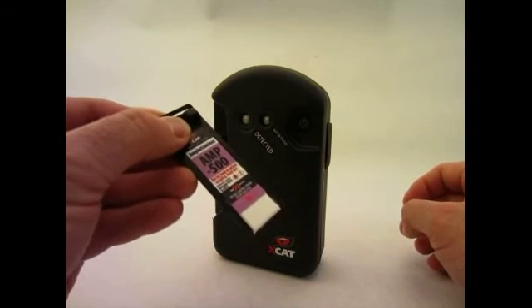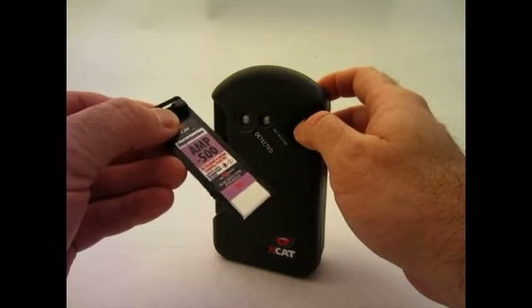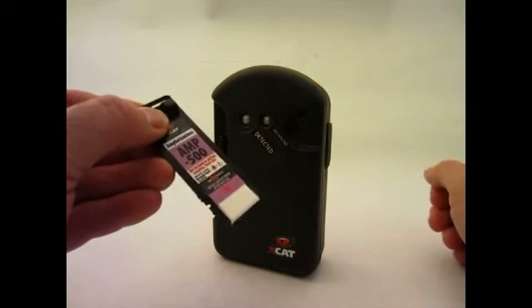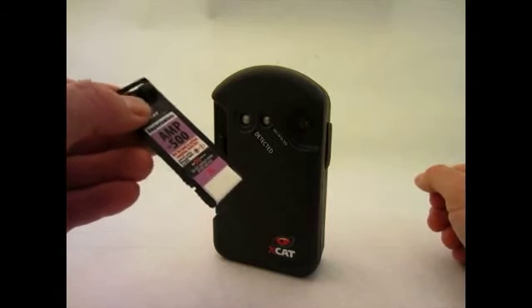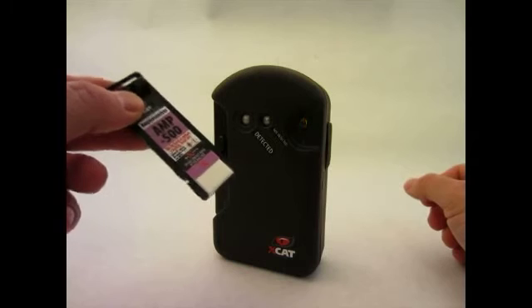After the sample is collected on the sampling card, press the XCAT power button and hold until the light begins to flash. Wait until the light stops flashing. When the light glows solid, the unit is ready for use.